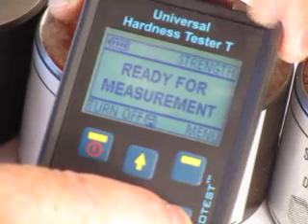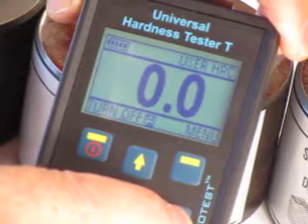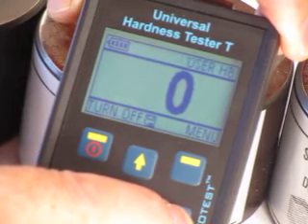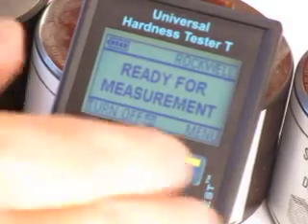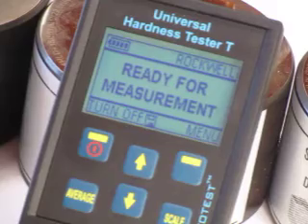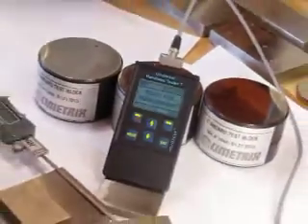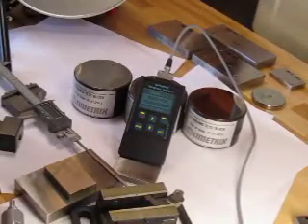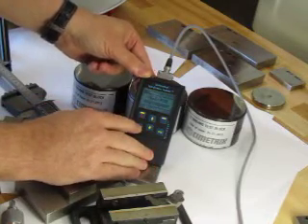We also have user-specified values — two for Rockwell C, Brinell, and Vickers — as well as tensile strength. This is a comparative tester, so you can have a known sample and calibrate the unit to that sample. For example, if you have a titanium sample or two known samples, you can calibrate the unit and get extremely accurate results.